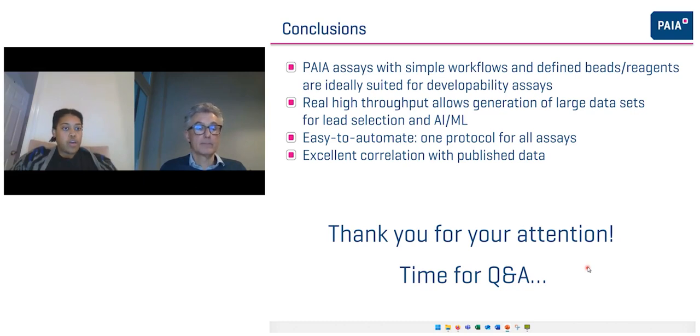Perfect. Okay. This is a similar clarification about the shelf life. So the shelf life of both the plate and the reagent that comes in the bottle are both 6 months. Yes. Yes.